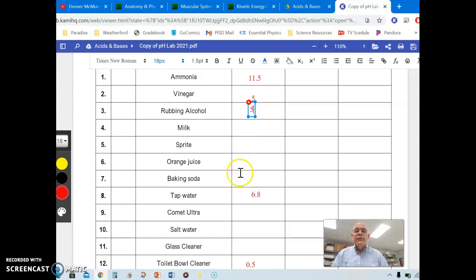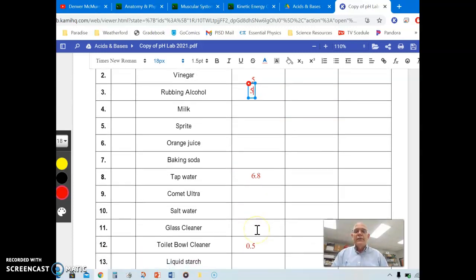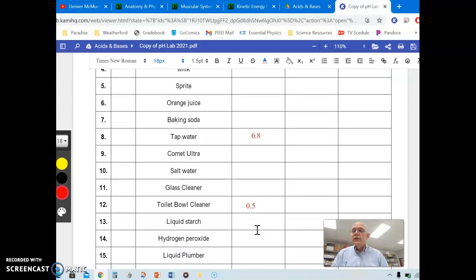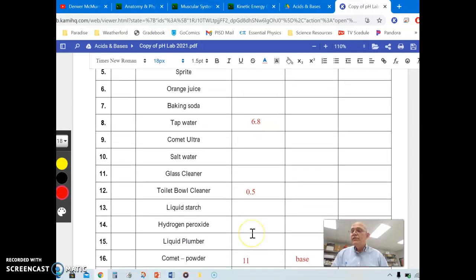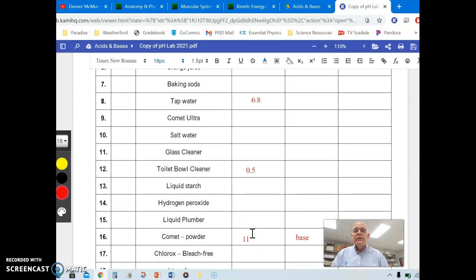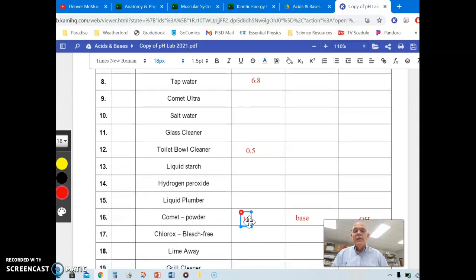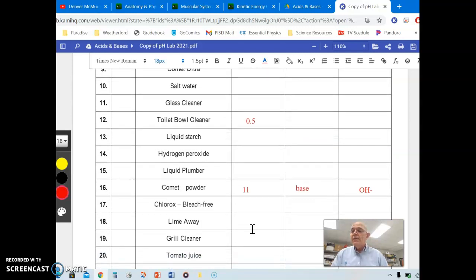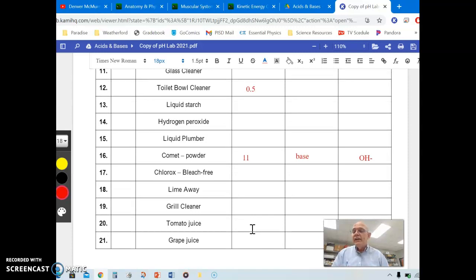Comet Ultra is 6. Salt water is about 6. Glass cleaner is 12. Liquid starch is 8. Hydrogen peroxide is 5. Liquid Plumber is 13. Comet powder we did was 11. Clorox bleach free is 13. Lime Away, which you use to get all the buildup off your tiles, the carbon deposits and limestone deposits, is 1.5. Grill cleaner is 13. Tomato juice was 5. And grape juice was 6.